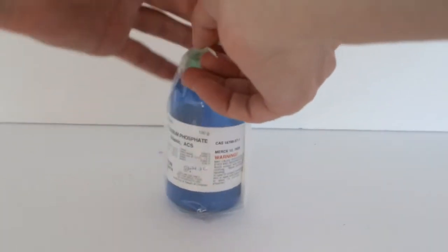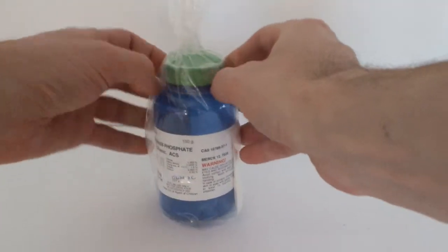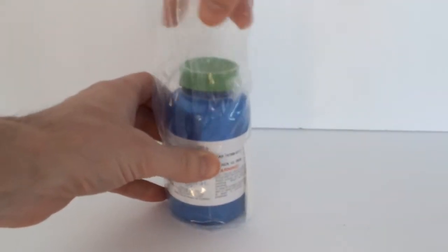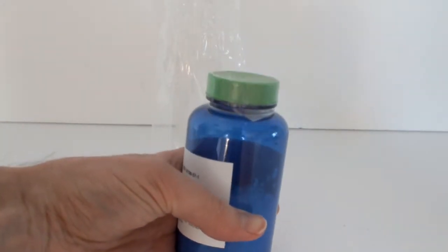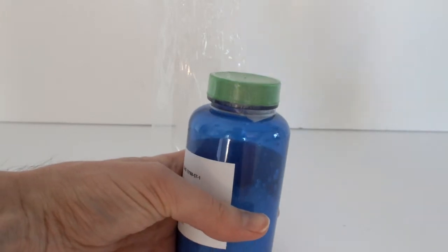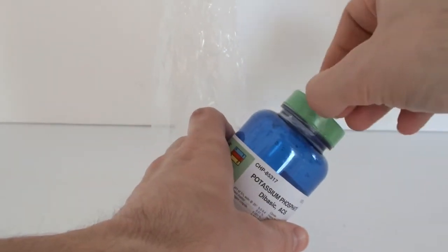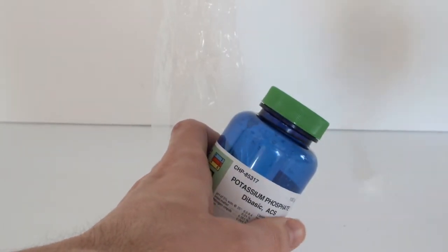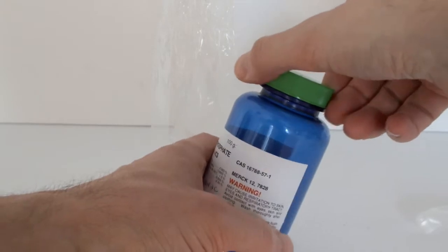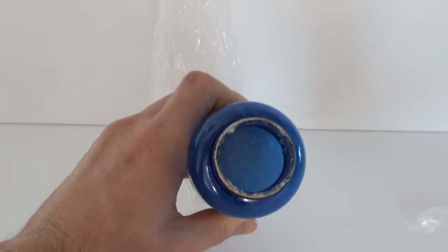A substance that is deliquescent is one that not only attracts and absorbs atmospheric moisture, but it does so to the point of dissolving in the moisture it attracts. Now that I have it open, you can also see that I've sealed the bottle with parafilm. Once we get that off, you can see that when I open the bottle, the crystals are still free-flowing and they survived well.